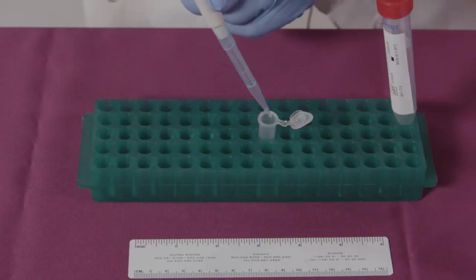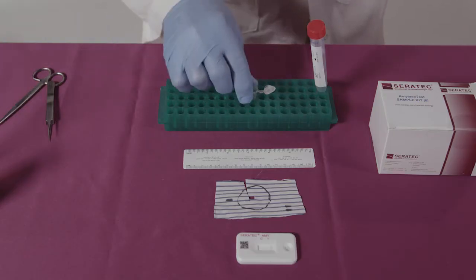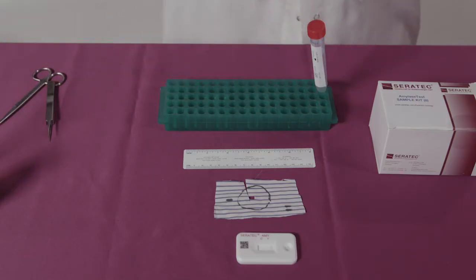To conduct a test, add three drops or 120 microliters of extract to the sample hole on the cassette. You will see the sample travel up the membrane.